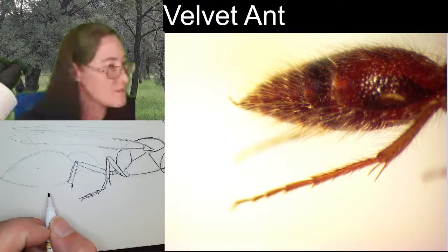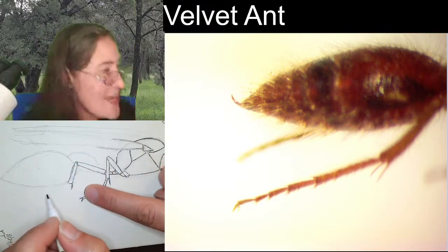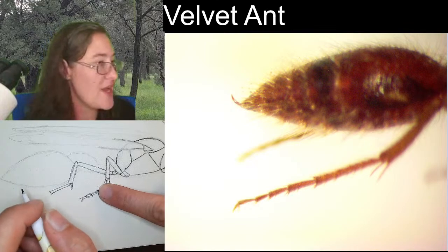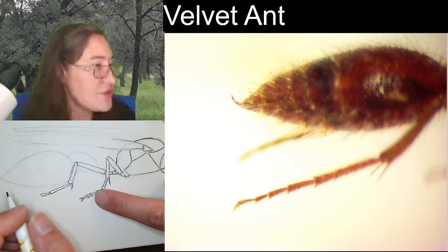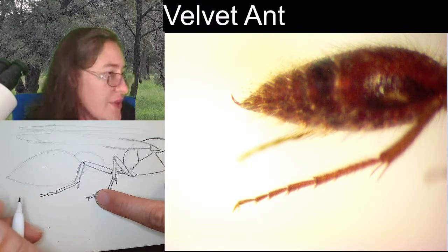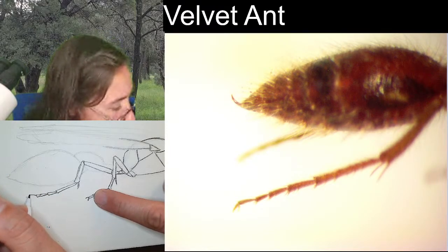This first tarsal segment is nice and long. It is essentially as long as the tibia. So you can take this length here and you can put it right about here. All right, so that's one. And then two is, I would say, a little less than half that. Two. And then three is just a little bit smaller than two. Three. Four is about half that. And then five is about the length of three. But instead of it being flat at the end, it's more rounded and it's got the claws.